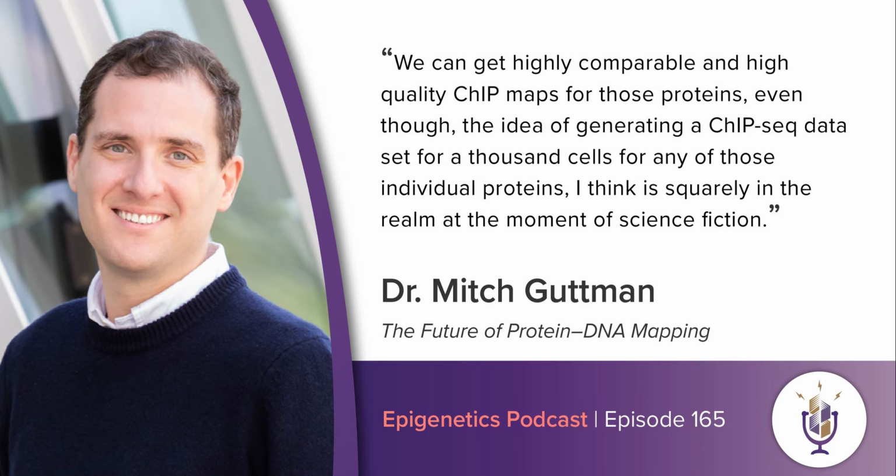So I just thought of something else. What happens if there are many modifications on the same nucleosome? Is it possible that a bead or an antibody binds to the same nucleosome, and what happens in that case? Yeah, so that's a great question, and actually one that we thought a lot about, not as a problem, but actually as an opportunity. Because in a way, if you were to get multiple beads binding to the same nucleosome, then not only would we be able to map them, but we would actually be able to observe co-occurrences on the same molecule of chromatin. In practice, we don't see that.